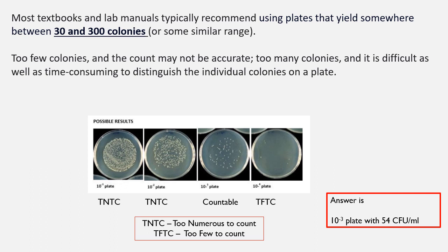Too few colonies can indicate something went wrong while performing your spread plate or while pipetting out 0.1 ml — so it may not be an accurate result. Too many colonies — designated TNTC, meaning Too Numerous To Count — makes it very difficult and time-consuming to count colonies growing near each other. When colonies are very close together, it is difficult to distinguish each individual colony on the plate.